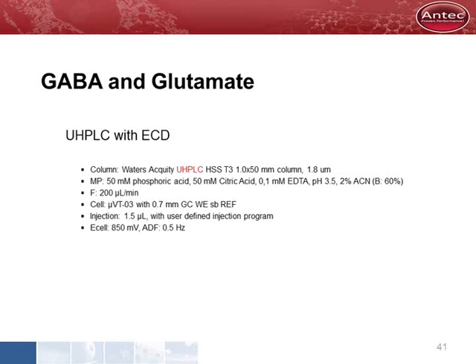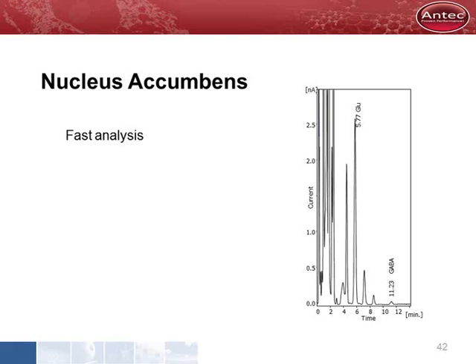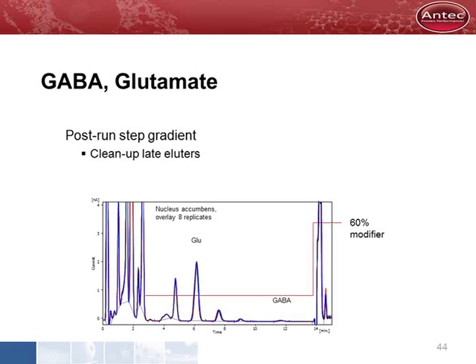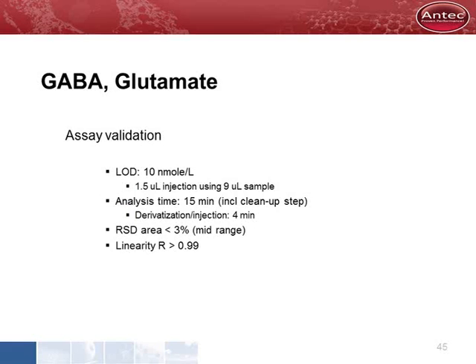We use a short UHPLC column to speed up the analysis. A real dialysis sample shows the peaks for GABA and glutamate. In the chromatogram, peaks appear between 30 and 50 minutes — these late eluters are a problem as they appear in the next chromatogram when running a sequence. To clean up these late eluting substances, we programmed a step gradient after the run. The column is washed in one minute, and during the next injection cycle the system is equilibrated and ready. A detection limit down to 10 nanomole per liter has been obtained, and the analysis time is 15 minutes including the cleanup step.